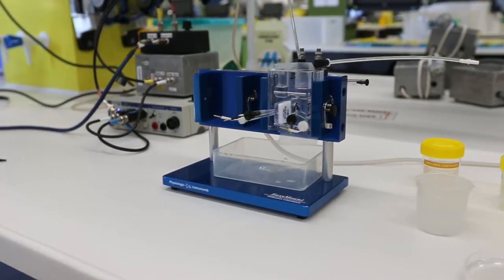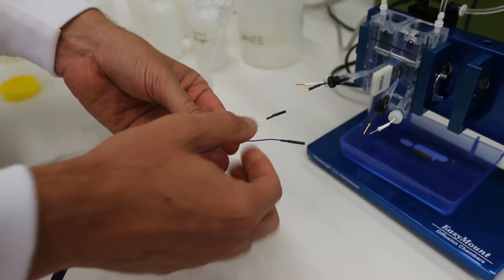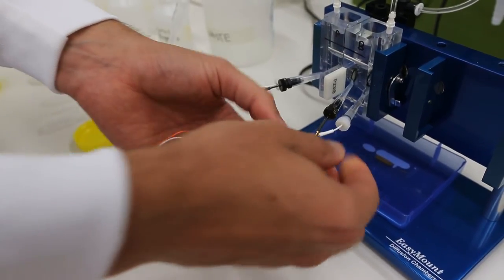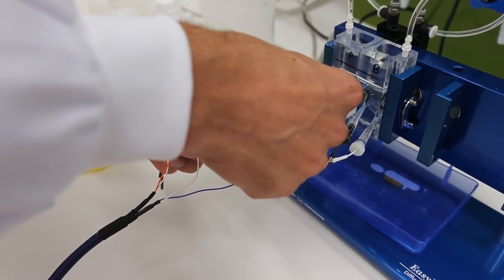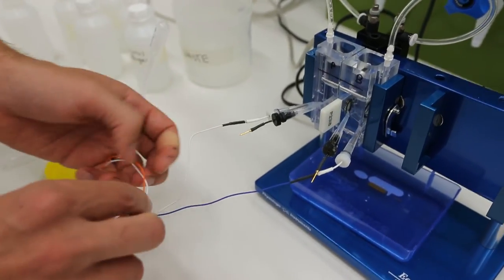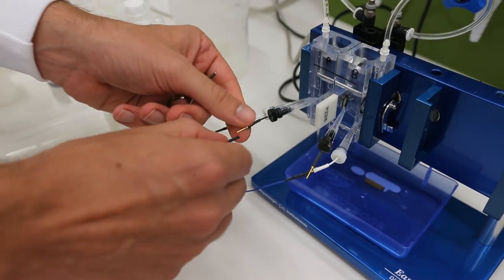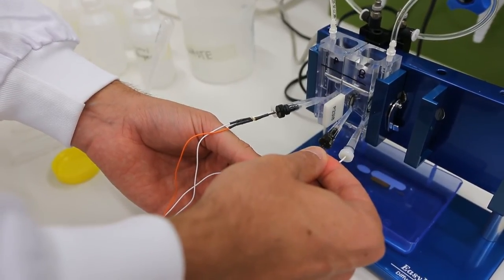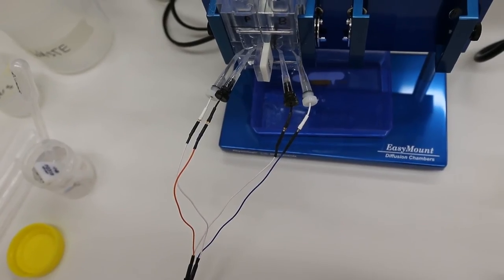The electrodes have now been assembled and we are ready to wire them to the power lab. Firstly, take the blue and white wires. Place the blue wire on the right white electrode and the white wire on the left white electrode. Then take the orange and white pair and place the orange wire on the left black electrode and the white wire on the right black electrode. Your connections should now look something like this.